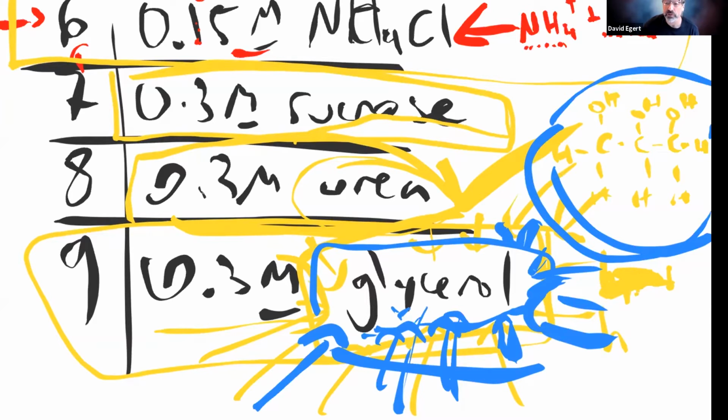Particularly in a lab, if we were doing this in person with 3 labs worth of students, so like 75 students all putting pipettes in the jars and putting it into test tubes. What is one of the real dangers of this? Contamination. That's one that actually happens a lot, where somebody gets a little sloppy and puts the wrong pipette in the thing and then cross-contaminates across the different solutions. There can be contamination in the test tube as well that you're using. There could be crap in there before you start.